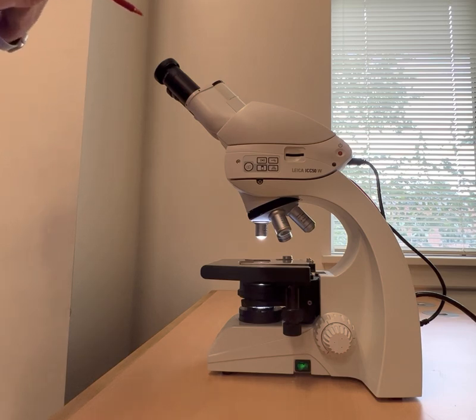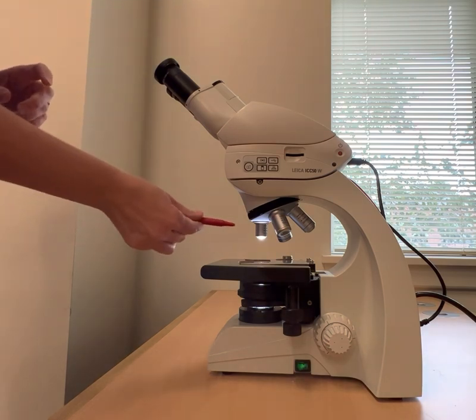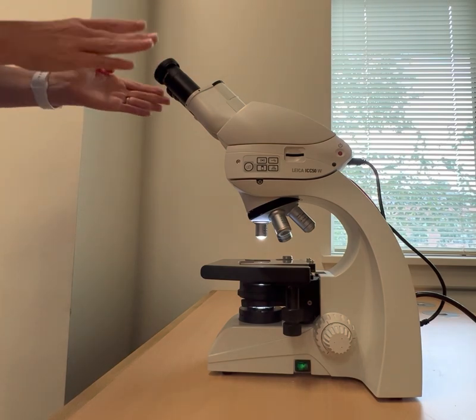Before you look through them though, I always tell my students, please clean them because you don't know who used it before you. So clean them with lens cleaner and lens paper, and you'll clean your oculars and you'll clean your objectives down below. Clean them before you use them. So safety first before you take a peek.